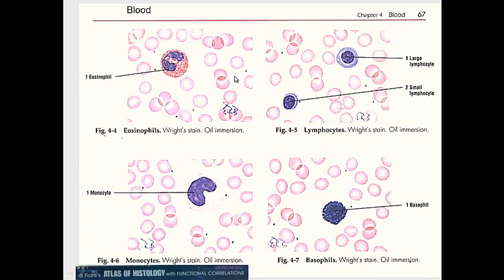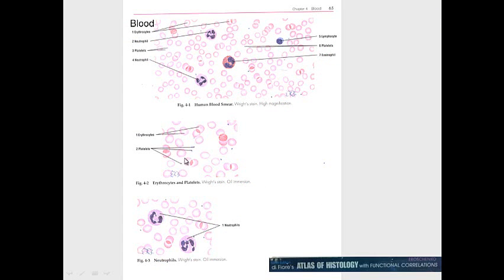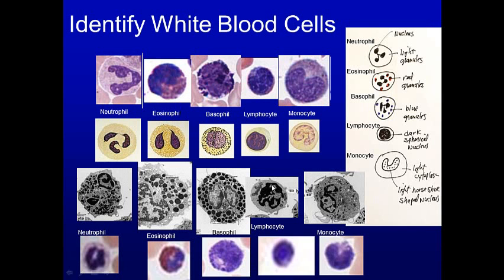Looking at blood cells, we see individual white blood cells - don't confuse them with cells in the surrounding tissue. We see eosinophils, monocytes, basophils, and neutrophils. The point here is to observe different colors and staining characteristics. The neutrophil, eosinophil, and basophil all have a lobulated nucleus; neutrophil granules are small, eosinophil granules are larger and red, and basophil granules are large and blue. The lymphocyte is the smallest, and the horseshoe-shaped cell is the monocyte.